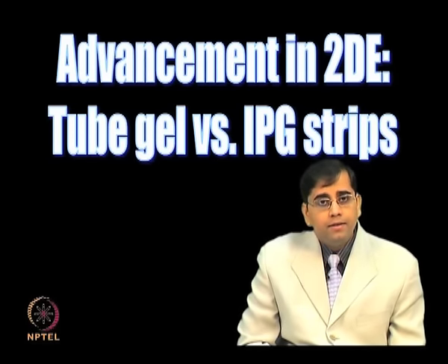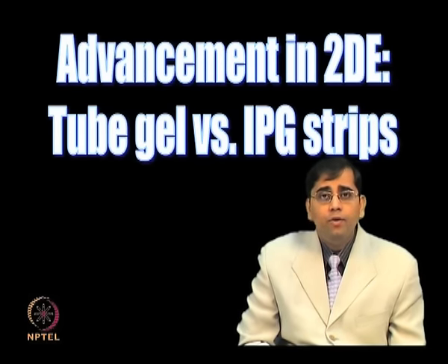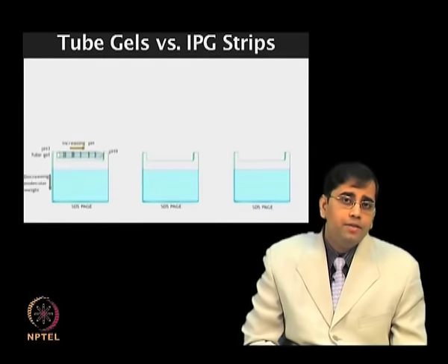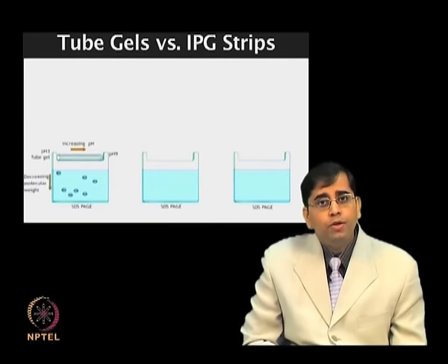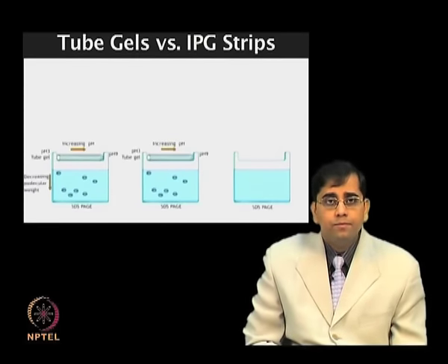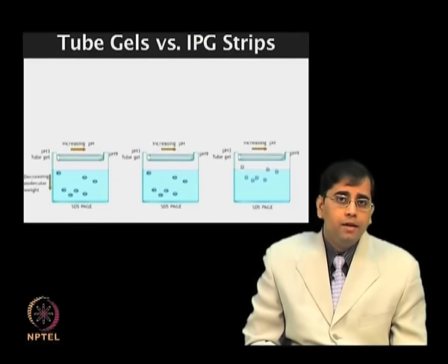The pH gradient in tube gels is established by ampholyte gradients, which are not always very stable and tend to break down upon addition of the concentrated samples. Analysis of protein mixtures by two-dimensional electrophoresis using tube gels often resulted in variations in the gels.